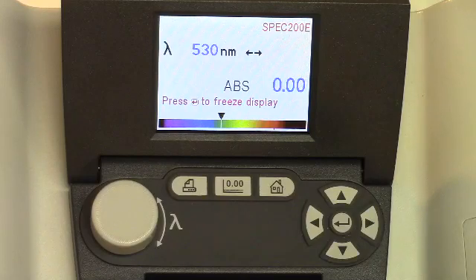So one of the things you can do with spectroscopy is using known concentrations. There's a linear relationship between concentration and the absorbance in the UV-visible spectrum. And so that's what we're going to do next, we're going to use a series of standardized solutions and look at their absorbances, and then you're going to make a plot from those. It should be a straight line.